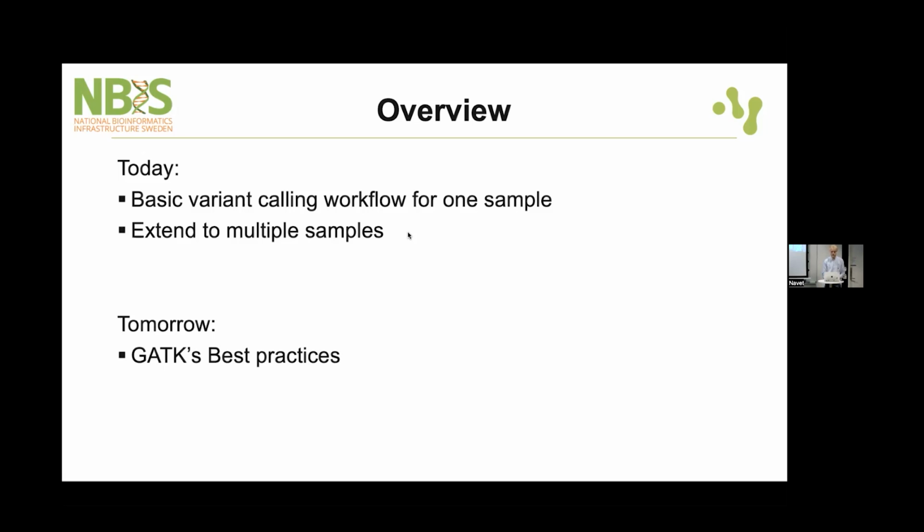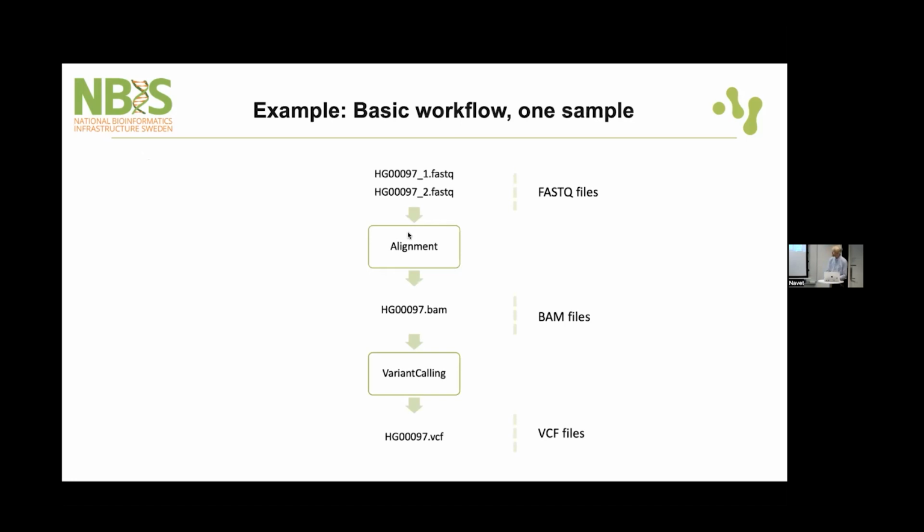And I should say that this is going to be whole genome sequencing based on the same set of samples that we looked at yesterday for QC. Now, our basic, simple, single sample workflow for going from raw sequence reads to a VCF file of variants will be based on running two modules.